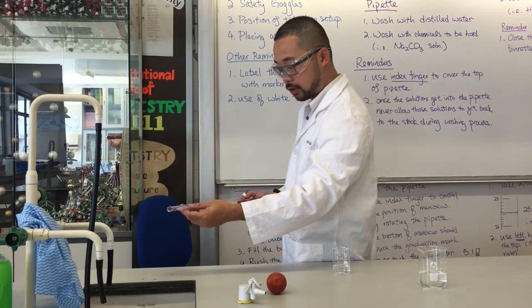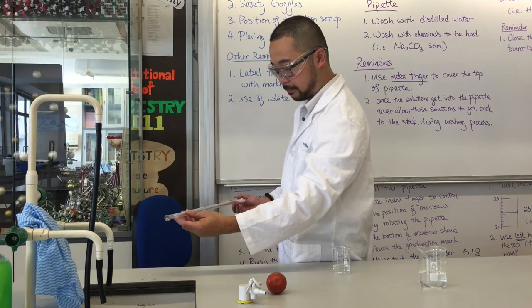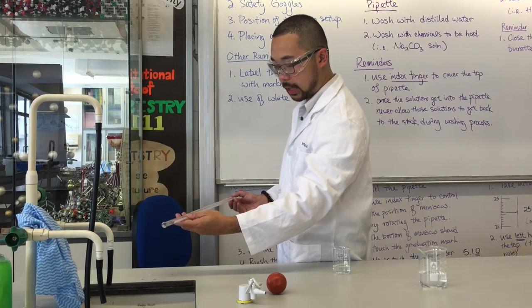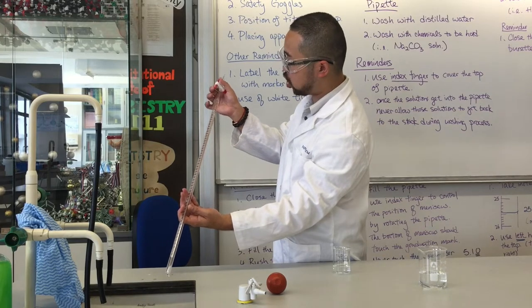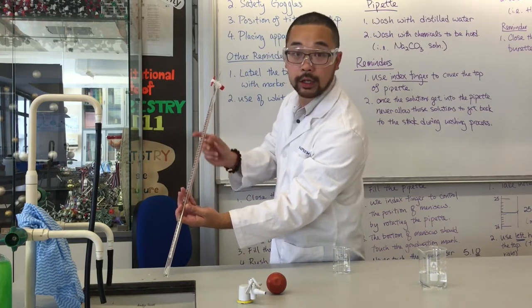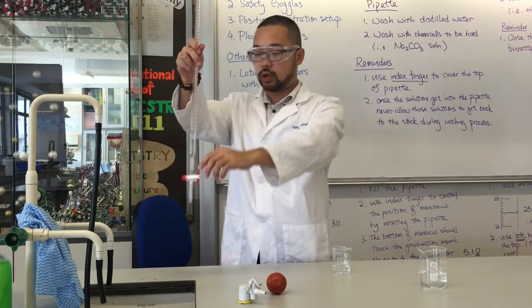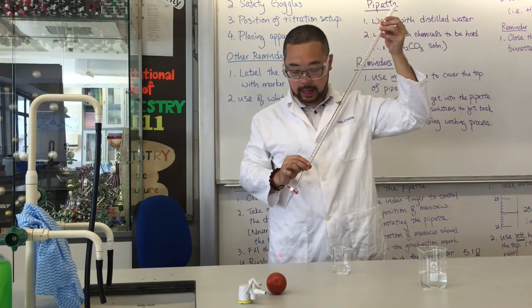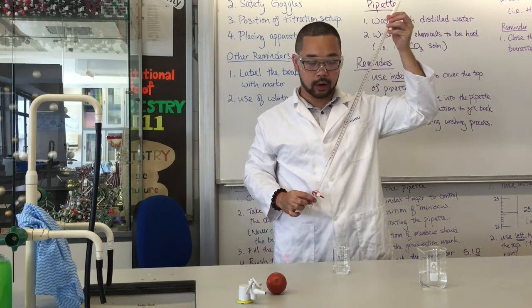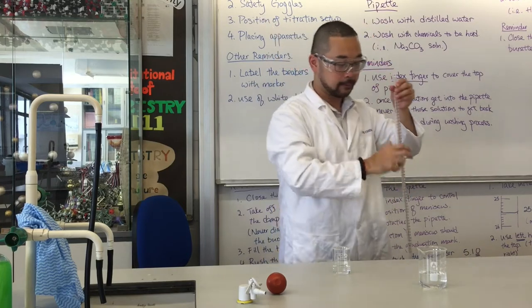When you place it horizontal, we rotate it a bit to clean the inner wall. If you find that is sufficient, we'll pour it out and open the tap, letting the last drop flow out into the sink. After that, we're going to do the same for the nitric acid. This time, remember again, make sure the tap is closed, otherwise when you pour the solution, the liquid will flow out the other end.